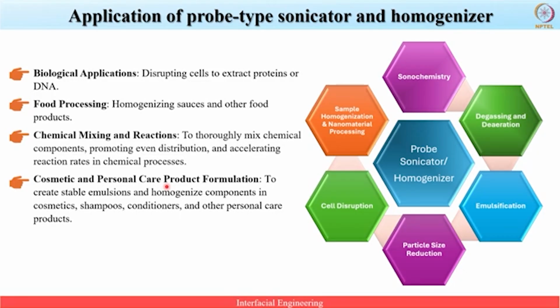what is the advantage of the homogenizer? One is the high efficiency, another one is scalability. Another one is versatility. And if we compare it with the probe type sonicator, the homogenizer can handle large samples efficiently, whereas the performance of the probe type sonicator decreases with increasing sample size.